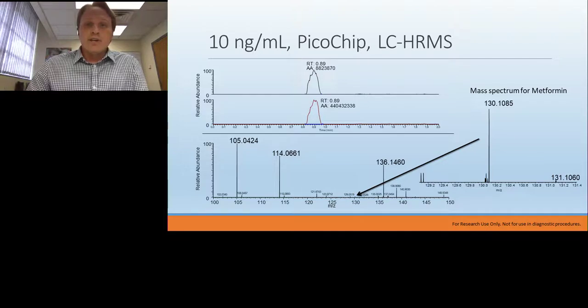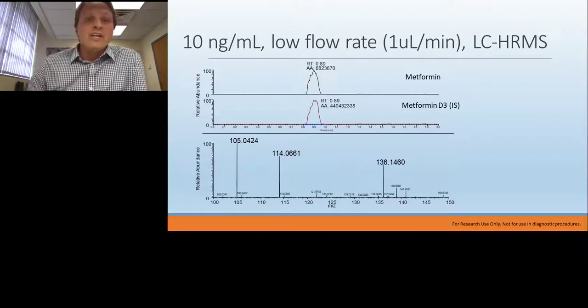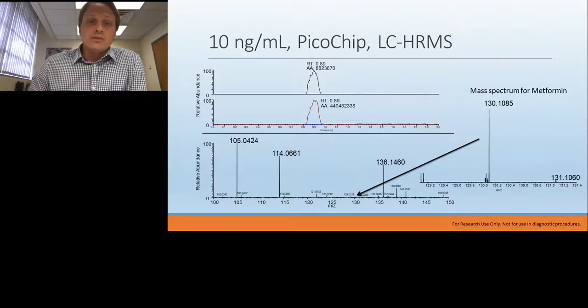If you look very close down, sorry, excuse me, I'll go back to that slide before. That wasn't the product ion. The point I'm trying to point out there, this is the background in a high resolution scan. And the next slide, this is where metformin is. So it's really down around 10% of the signal, and it's in what you consider the noise of a typical mass spectrum. But now we have very clearly isolated the compound using high resolution and high mass accuracy.